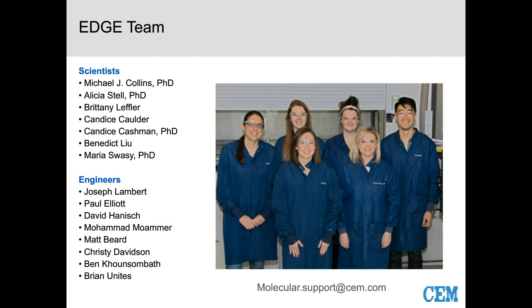Yeah. We didn't do that. We didn't do an exhaustive study with multiple cycles. We were just collecting the 2 cycles, and then we ran a blank after we removed the sample. So that would be something we could add to the list of what we run, to do that exhaustive extraction that I talked about, to show that we are no longer getting any PFAS out of there. That is a good rule of thumb when you're developing methods. Like I said, this is preliminary data, so that's part of the next stages as well.